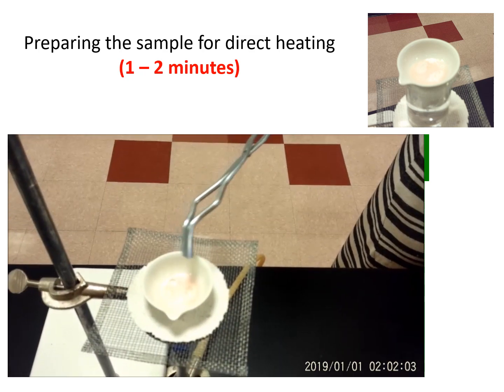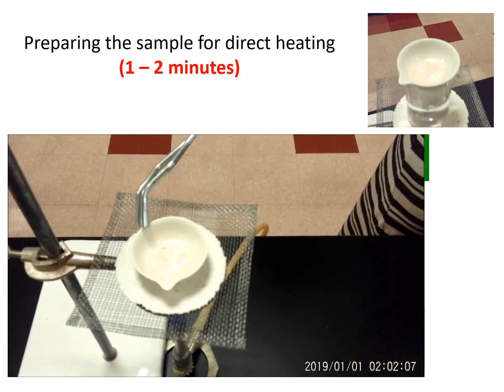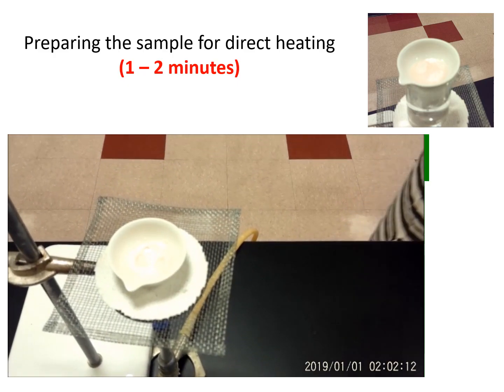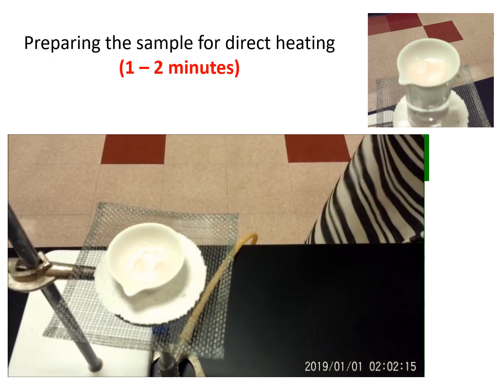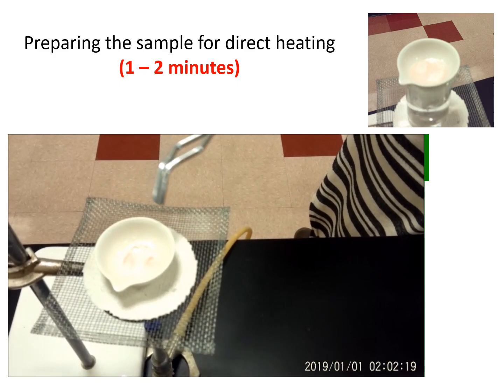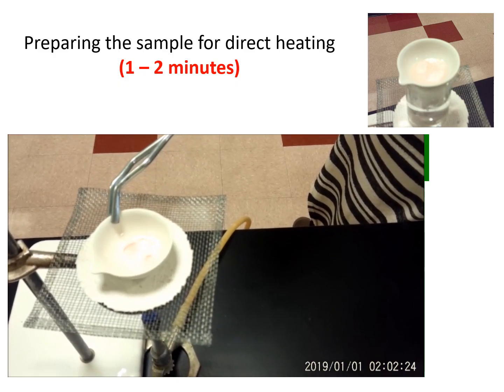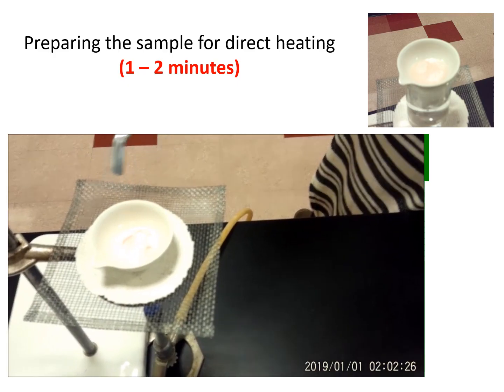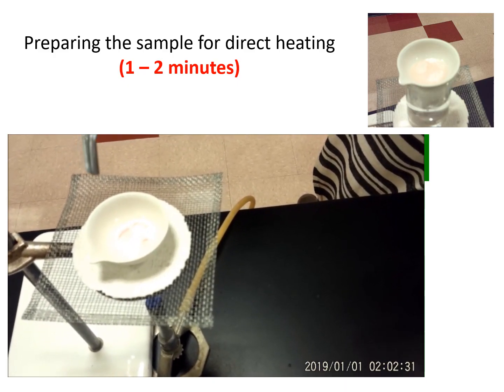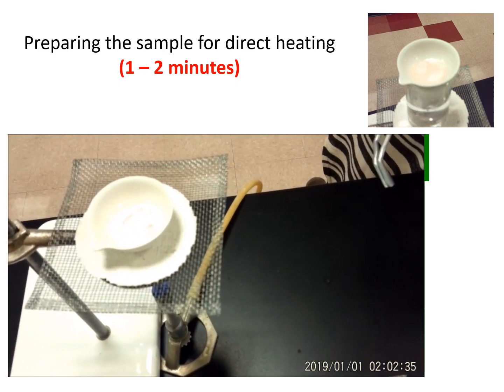You can see there's still some water, liquid that's being boiled off. So what we're trying to do is some gentle heating to boil off the remainder of the liquid. Now, why is it bubbling? Remember, we had some light portions and some darker color. The darker pink, you can hear it actually boiling. The darker color is from the water still being present. So we're going to do gentle heating until all of it becomes light pink as much as possible.